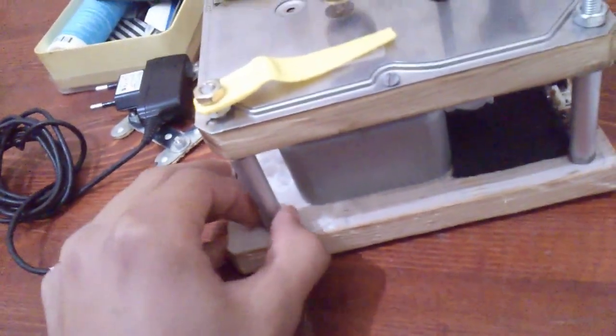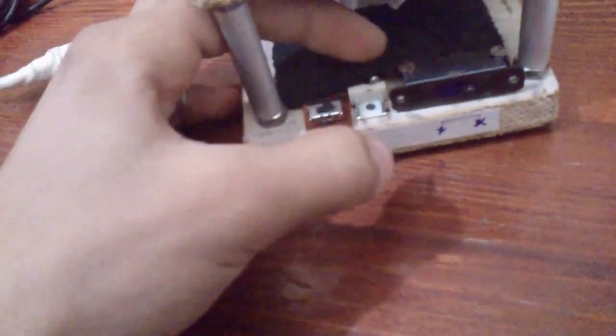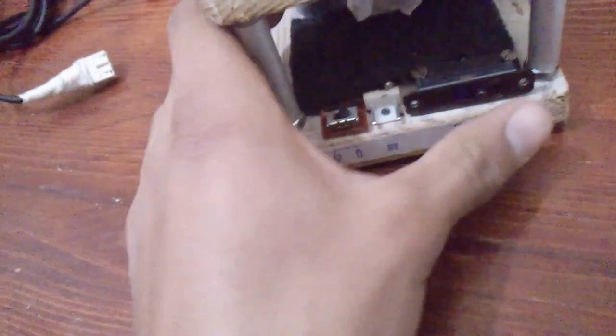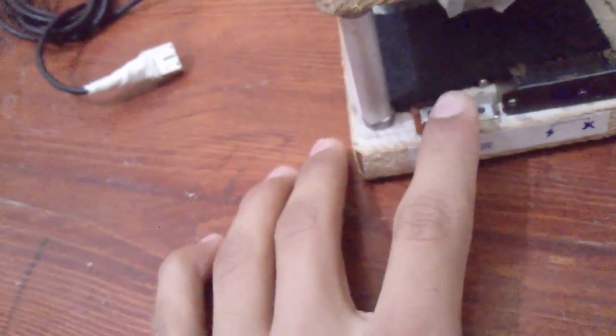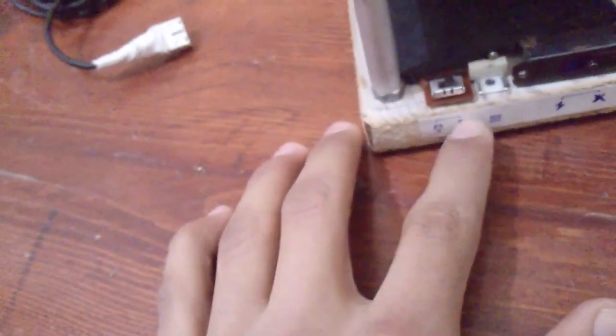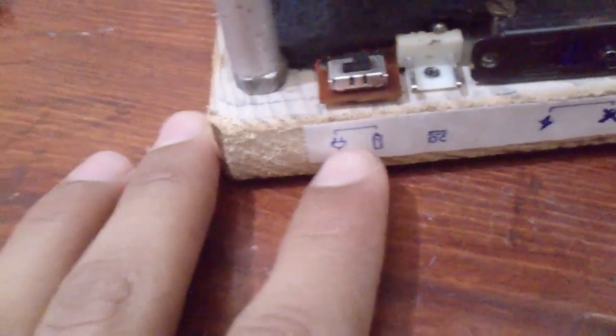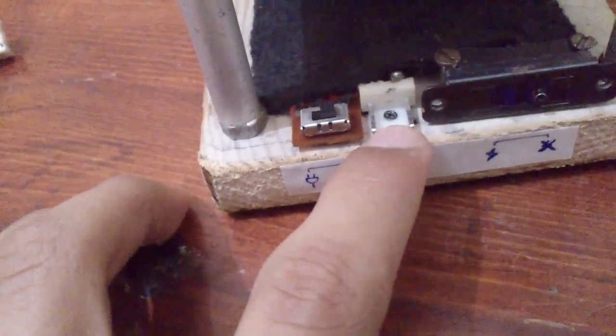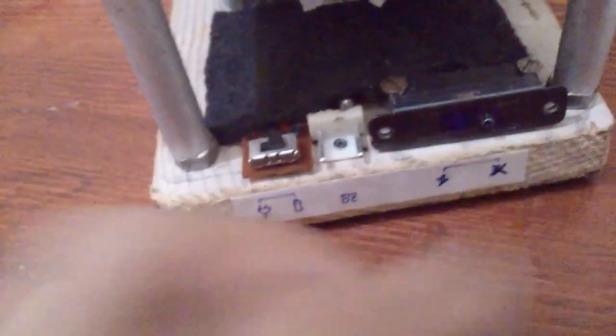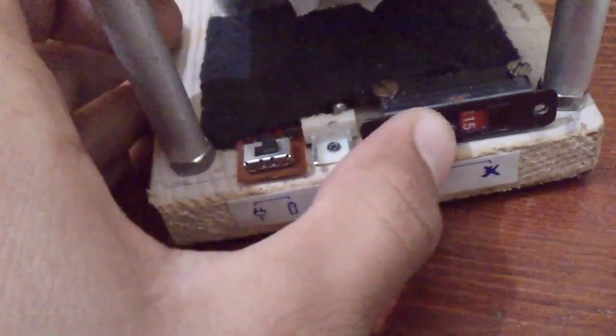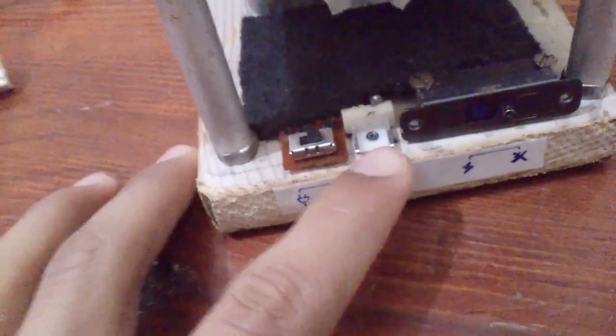The improvements I made to the electric part is adding a rechargeable phone battery inside it. This button right here is to choose between using the battery or using the power adapter electricity. This is the port for the power adapter, and this one right here is to choose between charging or not charging the battery when the power adapter is plugged in.